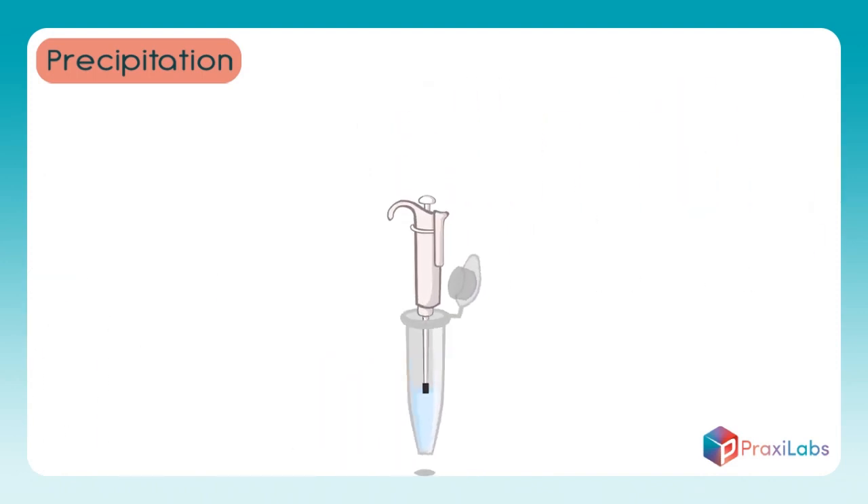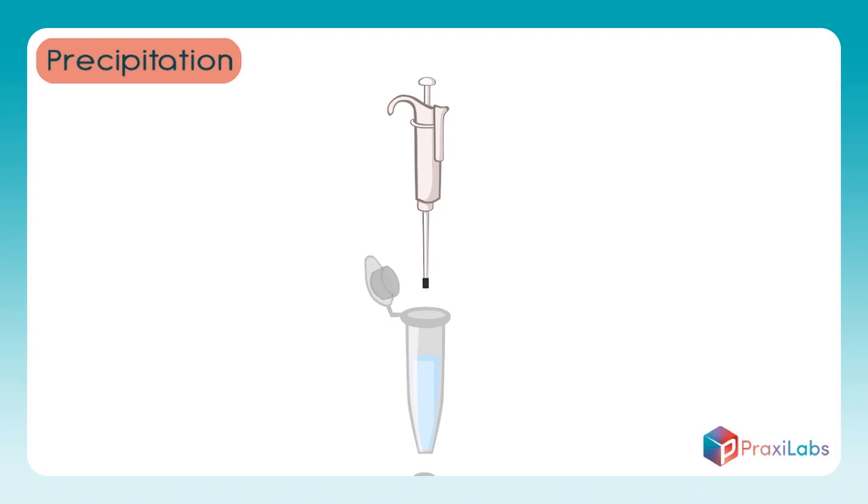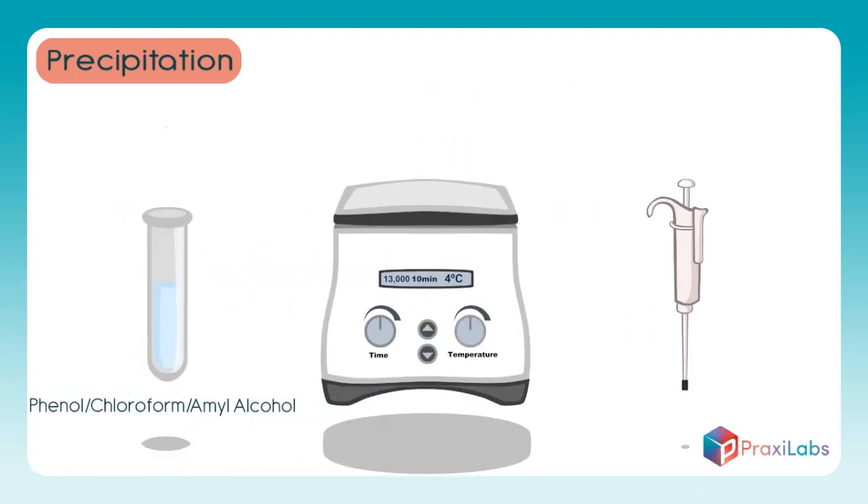Remove the top layer using the pipette, then place it in a clean tube. Repeat steps 7, 8, and 9 twice.